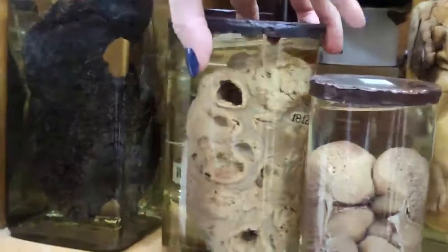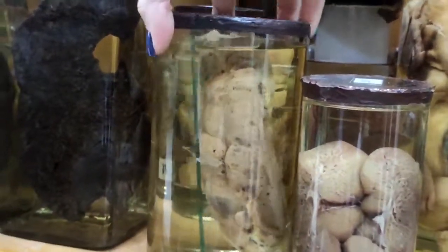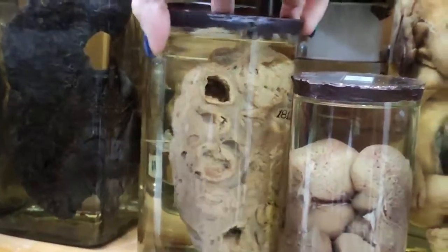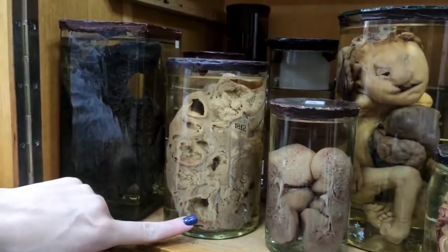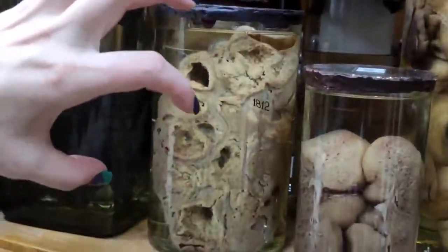Okay, the next specimen, what is it? Kidney with tuberculosis, no? Or polycystic disease? Polycystic disease. Tuberculosis, okay, polycystic later. It looks similar a little bit. So, here you can see enlarged kidney and multiple cavities.